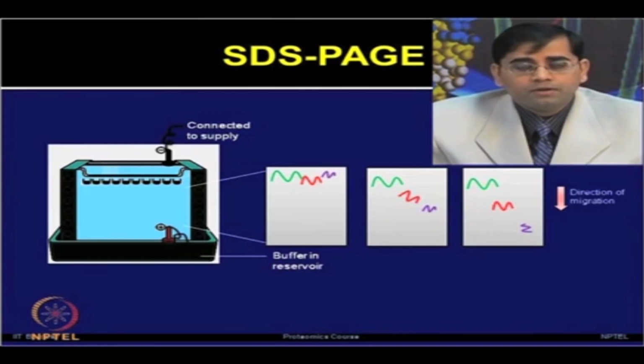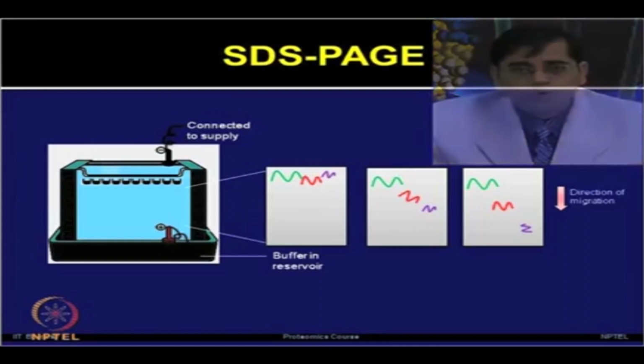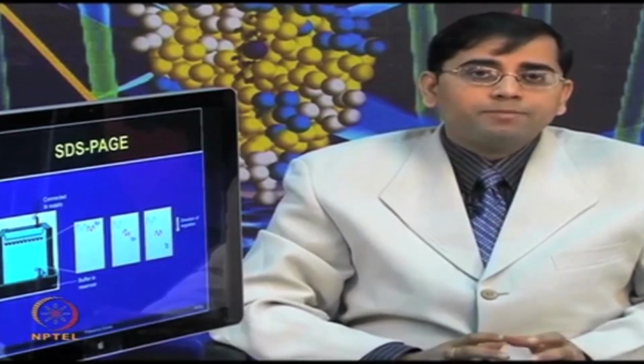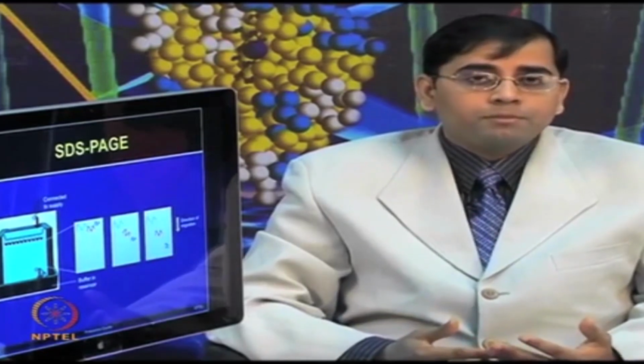So, depending upon the protein size, you can separate the proteins based on lower and higher molecular weight in this SDS PAGE gel. You can add the standards or known molecular weight proteins to determine your unknown proteins. I think it is important to clarify that in 2DE, when you use SDS PAGE, you do not need to make these wells by adding a comb, because you already have a flat IPG strip which has done the first dimension protein separation.